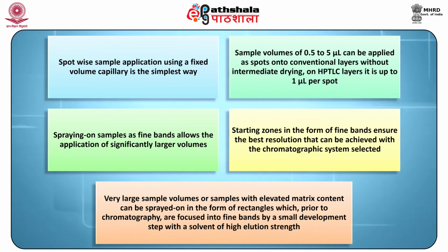Spot-wise sample application using a fixed volume capillary is the simplest way. Sample volumes of 0.5 to 5 microliters can be applied as spots onto conventional layers without intermediate drying. On HPTLC layers, it is up to 1 microliter per spot.